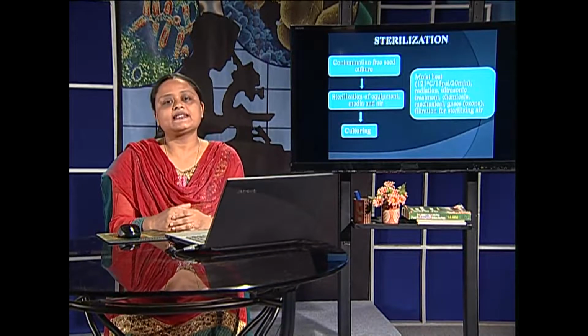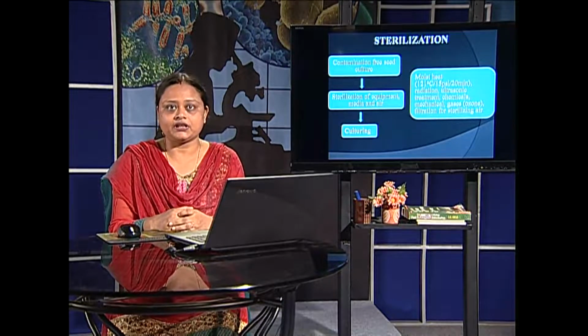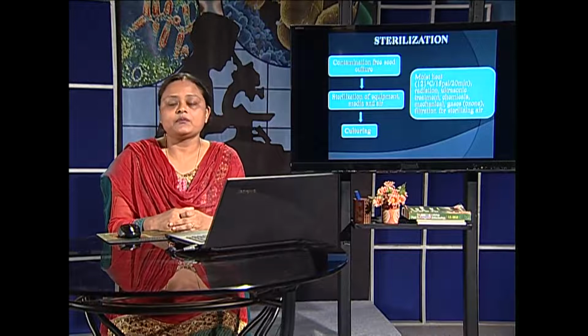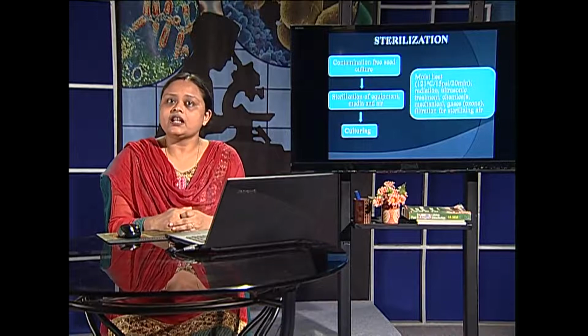Now we have seen some of the major components required in producing media for the industry, and it is again important to realize how to sterilize them. There are many components which when heated may get charred, like sugar-containing material, some which may produce viscosity, and likewise some products can even be toxic at higher levels. So sometimes individual sterilization of these ingredients is required, and at times we can also mix them and sterilize in bulk. So sterilization protocols differ depending upon the ingredients chosen.